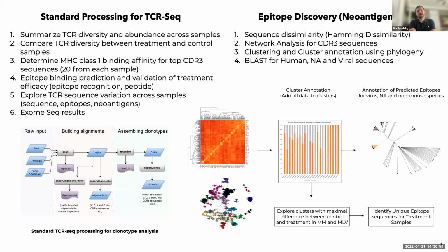Another example project is something a little more custom and not as widely used: TCR sequencing. These are T cell receptors, CDR3 receptors, where there is a limitation in what the standard output is, which really is just a proportion and quantification of clonotypes, but also a lot of results that are difficult to deal with.